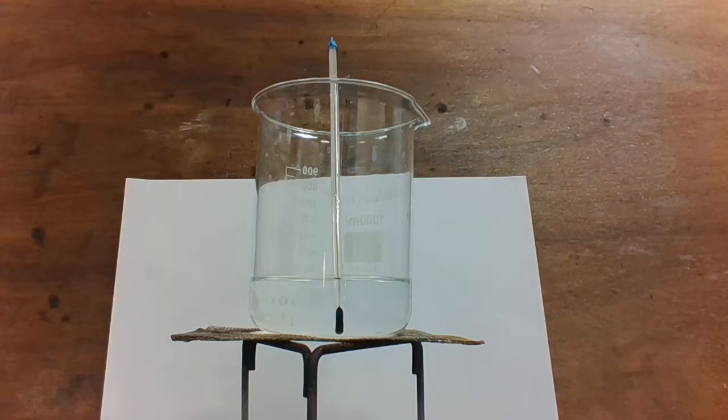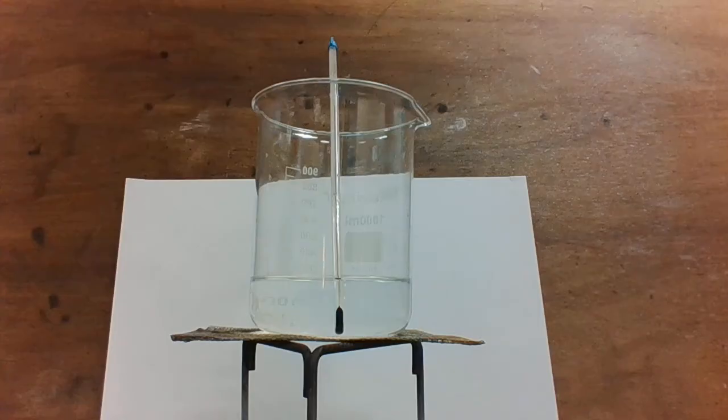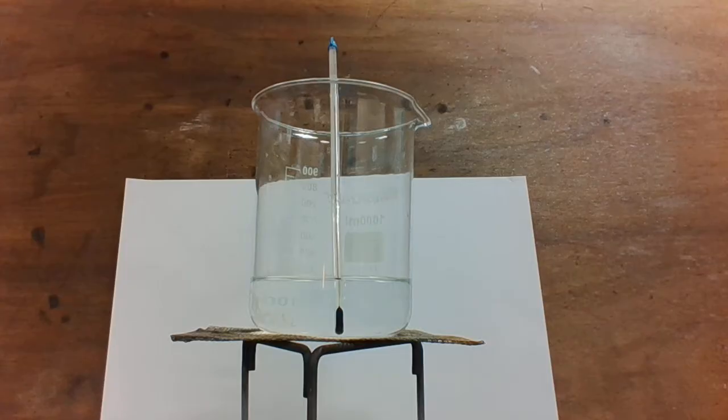In the large beaker, I have a solution of potassium sodium tartrate at about 60 degrees Celsius, to which I'm going to add some hydrogen peroxide solution, also at 60 degrees Celsius. The reaction between these solutions produces oxygen gas, so effervescence will be seen when the reaction occurs.